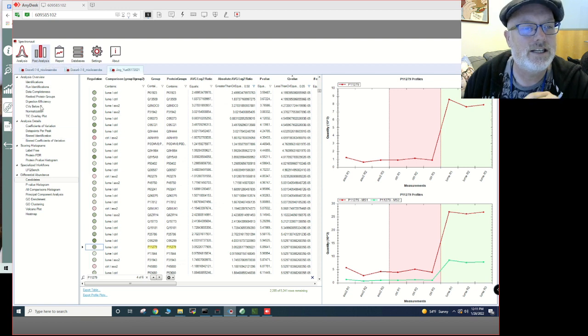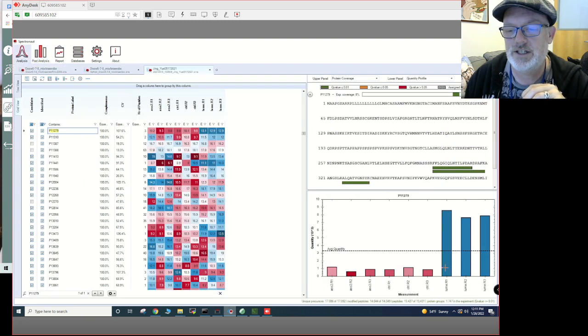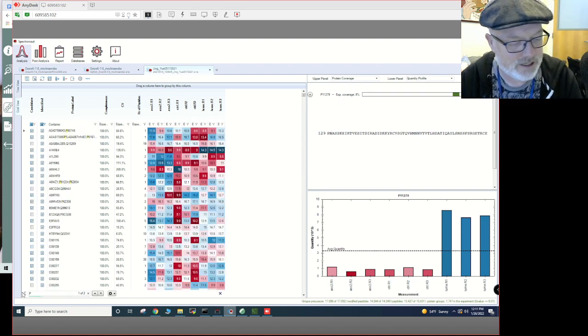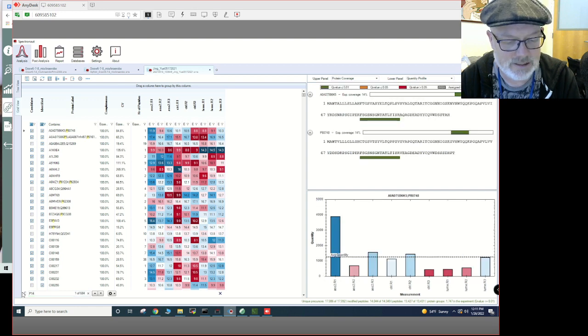It really isn't in the other samples, even though the imputation now makes it look like it is, but remember, it's imputed. And I wish they would, in the next version, go back and recolor these, or make a little arrow next to them that says imputed, because sometimes imputation really confuses biologists. And it confuses me sometimes.